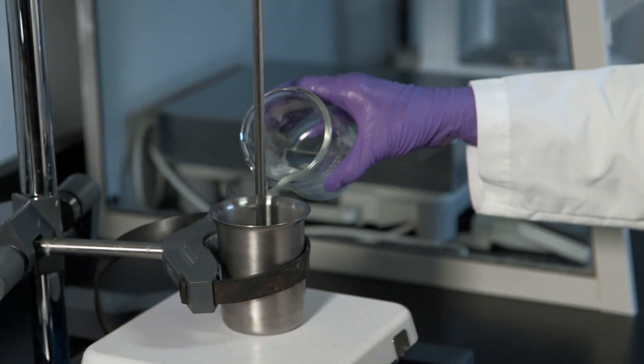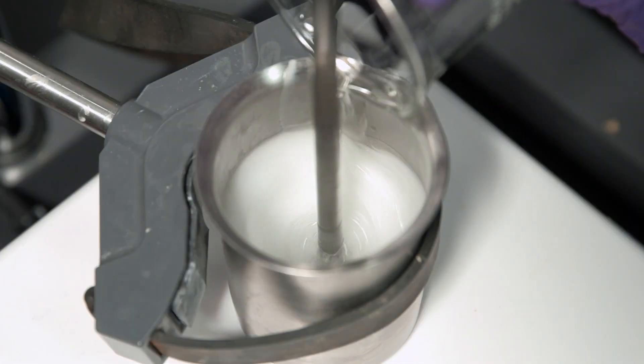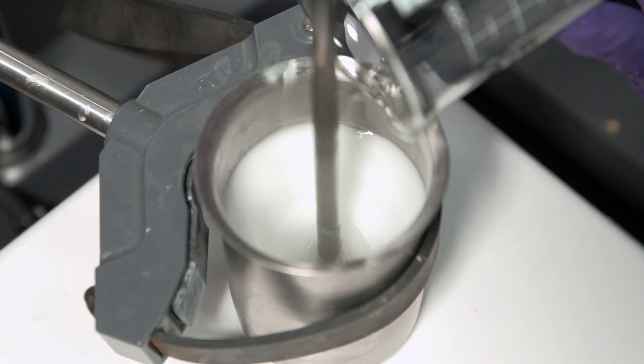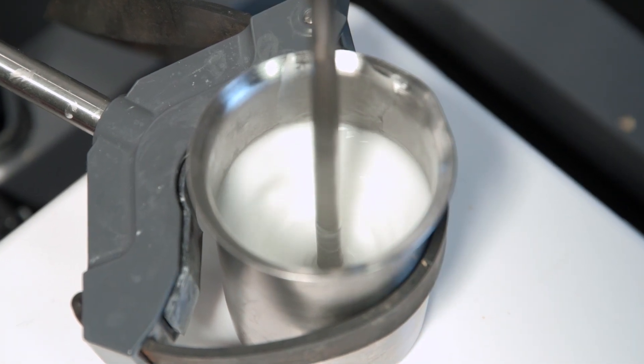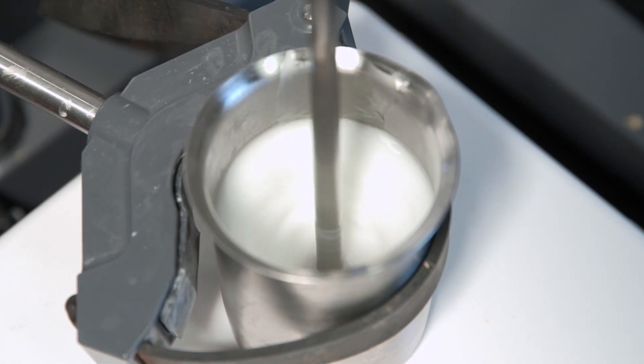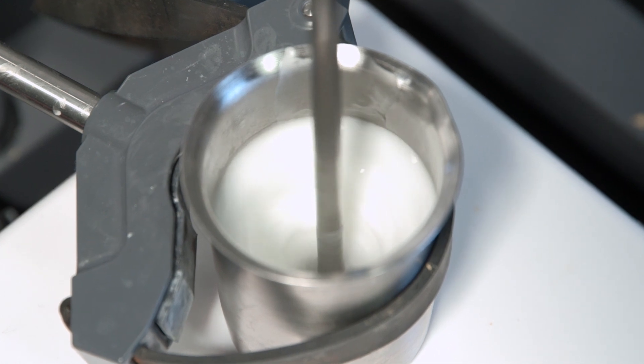The dispersed phase is added to the continuous phase slowly using moderate shear. It is clear that the macro scale emulsion has formed as the two phases change from translucent to a rich white color.